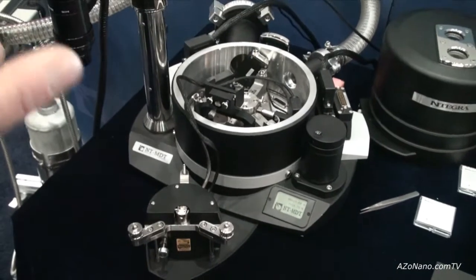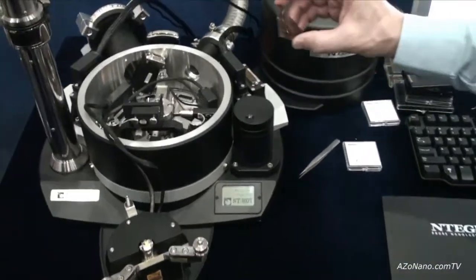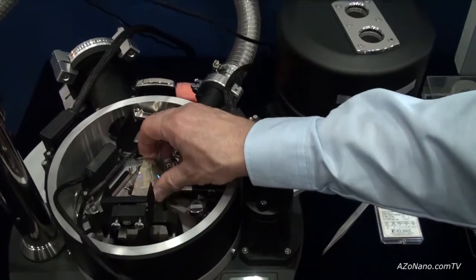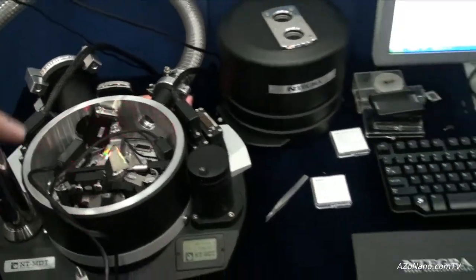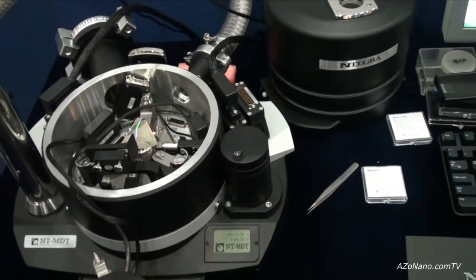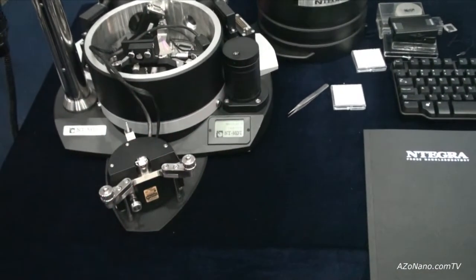So we load the sample this way. Yuri will help us to show this. It has magnetic and mechanical holders depending on the sample size. You see this one is pretty big. Then we install the measuring head from the top.